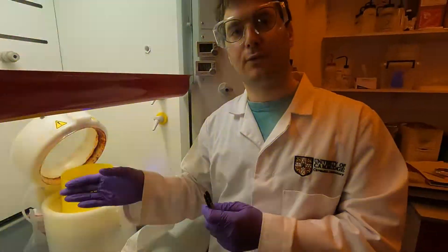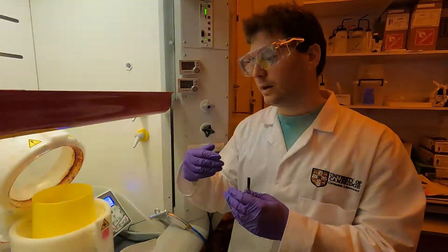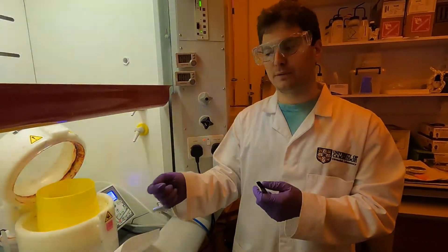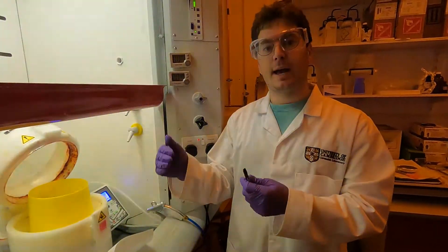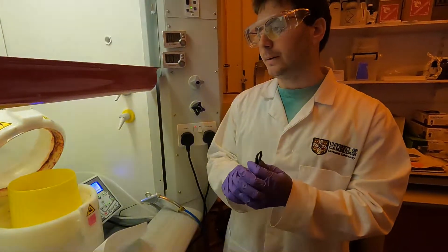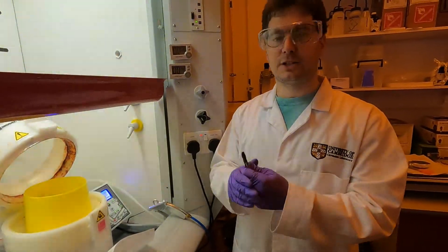It will sit at 65 degrees for one minute. When that one minute is up I will turn up the temperature of the hot plate to 95 degrees. Once the sample reaches 95 degrees I will leave it there for an additional four minutes.